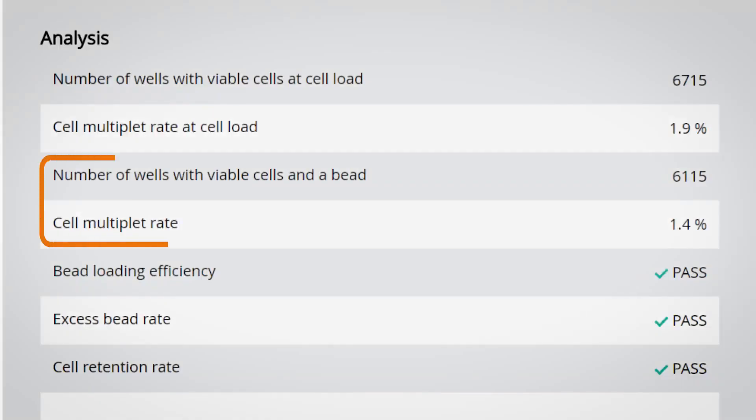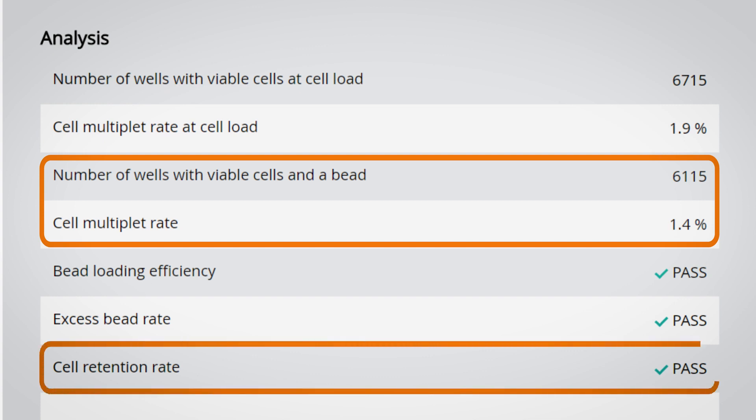In our experiment, we can see that after washing 6,115 cells were left in the cartridge with a multiplet rate of 1.4%. The cell retention rate has passed, so we are good to proceed to the next step.